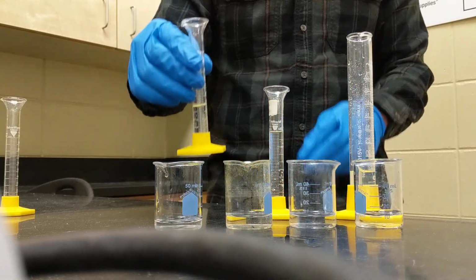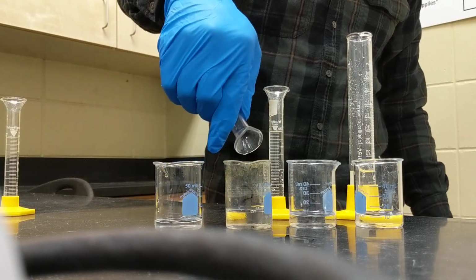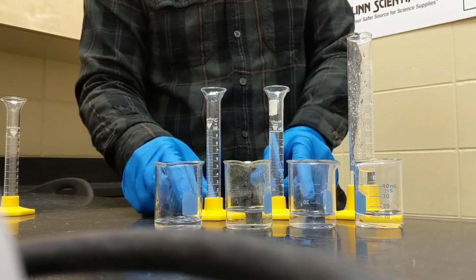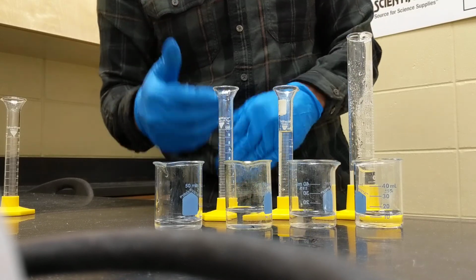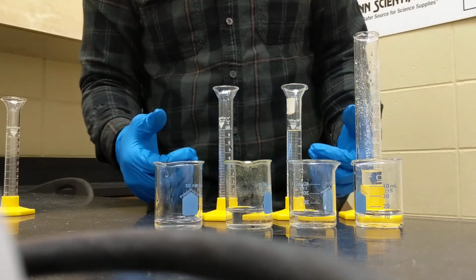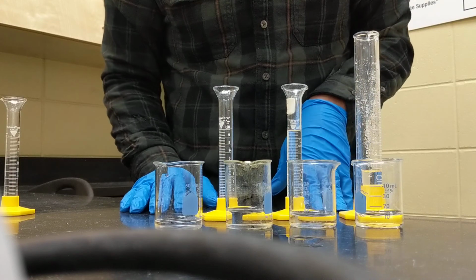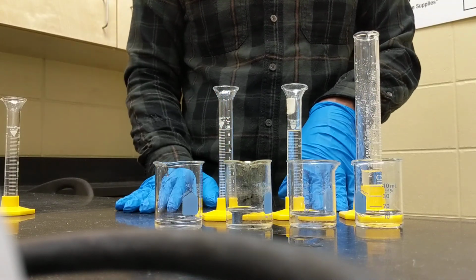So now I'm going to add 5 milliliters of the sodium thiosulfate here, and starting from me adding it now, I'm going to time the amount of time it takes for a reaction to occur and it to become cloudy to the point where I can't see that. Now, you would want to have your stopwatch, but because it's the technology age, it's likely that you've used your phone application and you're clocking the reaction, the time it takes for the reactants to interact with one another.